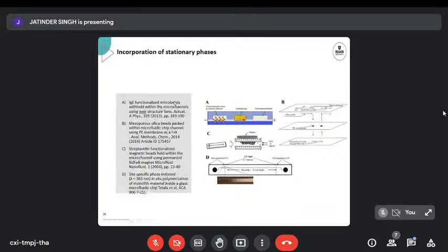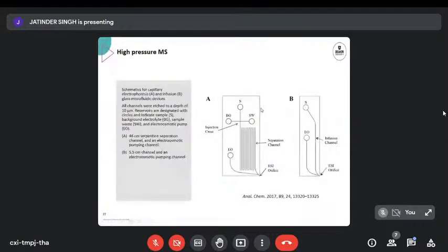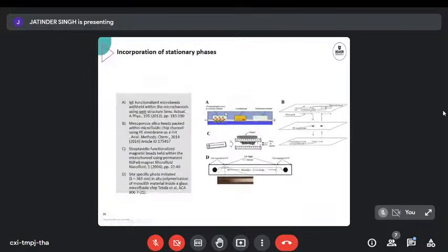So for proteomics, we've seen before that for DNA extraction, magnetic beads are great. You can do similar things with microbeads where you've got beads that are immobilized with, for example, IgE. Here you can see that with that, you can make chromatographic columns simply by the fact that the beads don't fit through a certain hole. Here we've got particles being fed in, and the liquid can get out, but the particles can't because they're stuck in place. They don't fit through the hole here, which means that if we can apply a potential difference, we can separate compounds based on their difference in time that they're stuck on a stationary phase. So we can do a limited kind of chromatography where we've got our IgE functionalized microbeads, with proteins coming past.